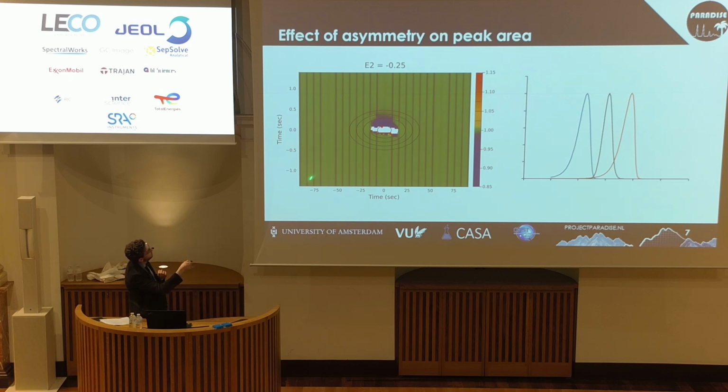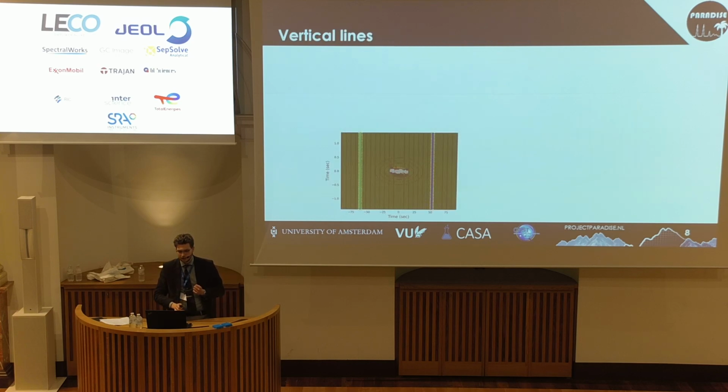And you might have noticed something, and that is that these chromatograms have these vertical lines in them. Even when we're very far away with these 2 peaks, we still have these lines. And we were quite puzzled by this at first, until we started to have a closer look at how the algorithms work. Now, as with any data analysis, we have to set a peak inclusion threshold, so to distinguish between peaks and noise. And even though there's no noise here, and we set it very, very low, we still end up with this scenario. And what is going on is that if we take a peak slice like this, we end up with all the modulations reaching above the peak inclusion thresholds. And so nothing happens and we find 100% of our area.